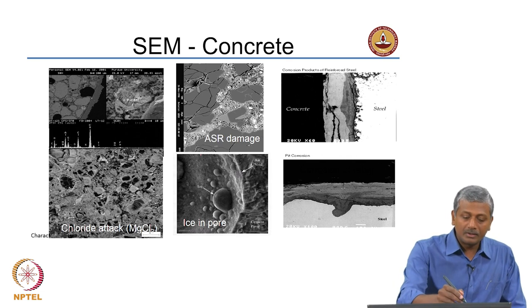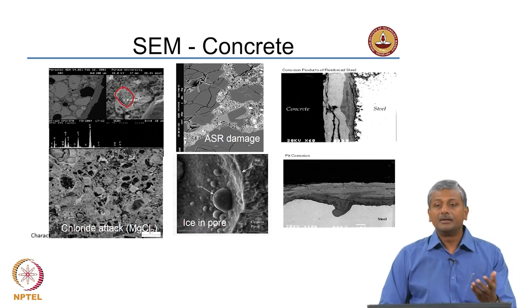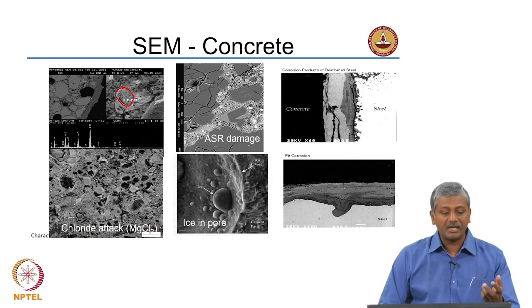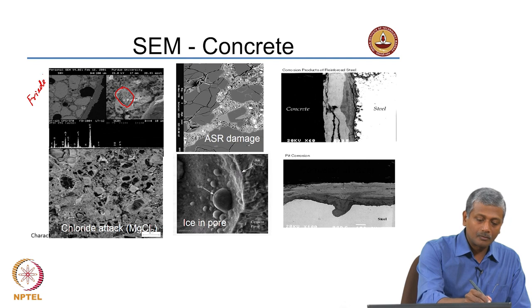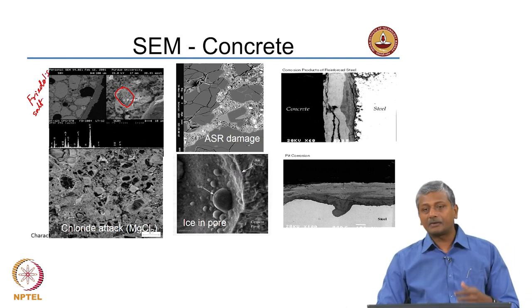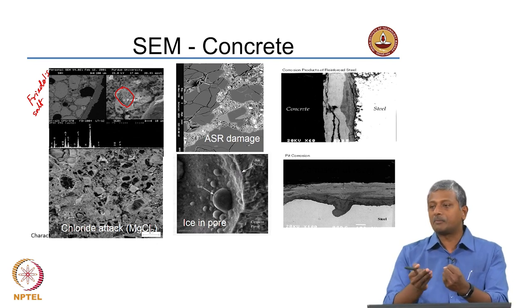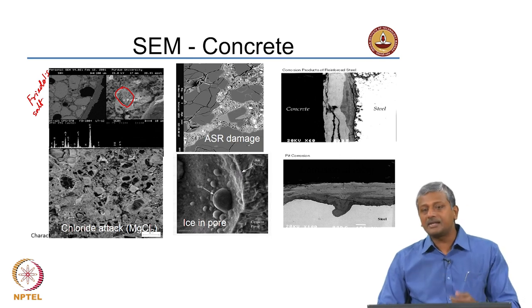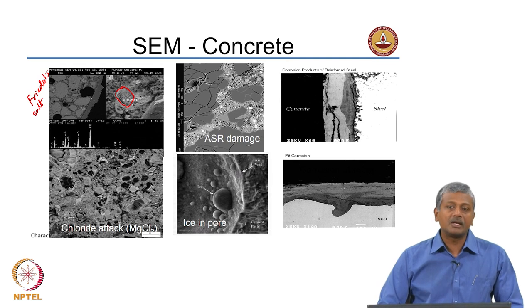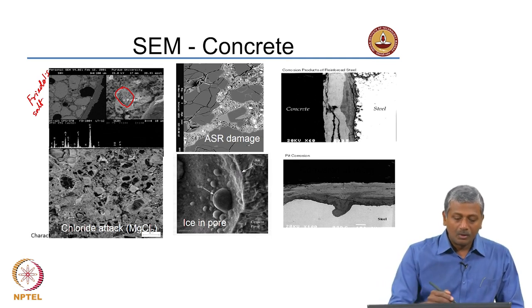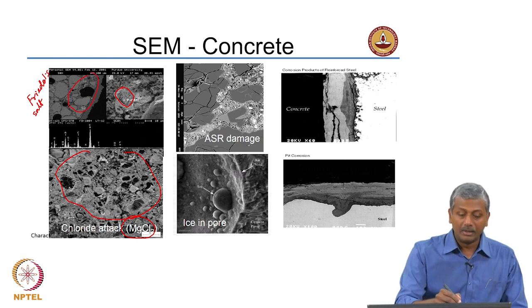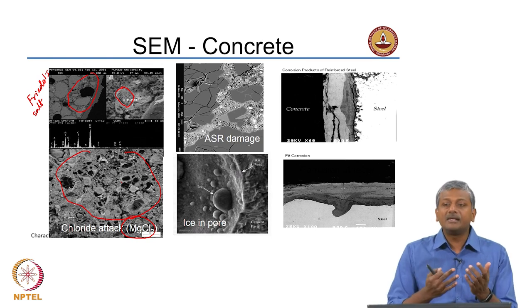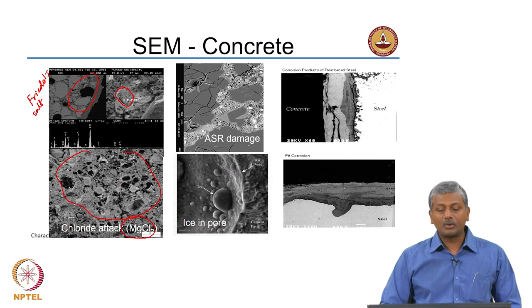Here are more examples of SEM from concrete. You see a phase marked as F-CSH in a cement mortar stored in a magnesium chloride solution. The chlorides form salts with the aluminates called Friedel salt. Aluminate phases in cement react with chlorides to form Friedel salt, which binds the chlorides and prevents them from reaching the steel and causing corrosion. This binding increases when cement is replaced with more aluminous supplementary cementing materials such as slag. In magnesium chloride attack, a highly porous surface zone is formed where the internal structures become completely leached out.